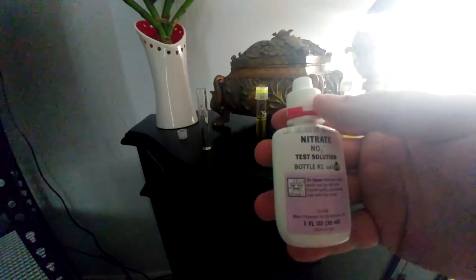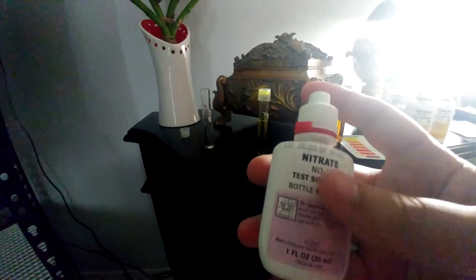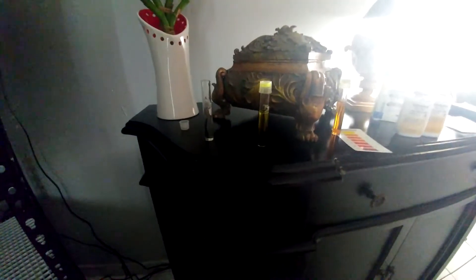All of these tests have specific instructions for each one, so make sure you're reading them. For the nitrate kit you add 10 drops and move it around. Then for bottle number two, the instructions say to shake it for one minute. I shake it for about 20 seconds depending on how much is in there — when the bottle is full it's harder to mix. We're going to open it up and add 10 drops.